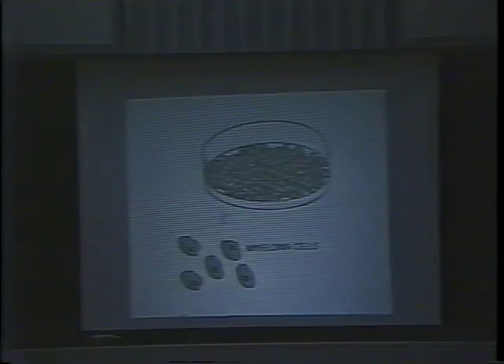A great discovery that would have a huge impact on cell sorters was made in 1976. In Britain, César Milstein and Georges Köhler discovered how to make hybrid cells that contained highly specific antibodies, which could be reproduced exactly and in endless quantities. They could also be easily stained with fluorescent dyes, and they readily latched on to very specific portions of cell surfaces, thereby labeling those cells and making them easy to sort.